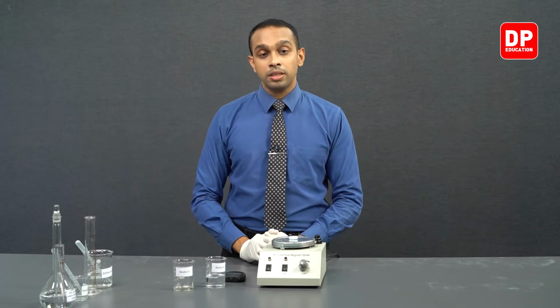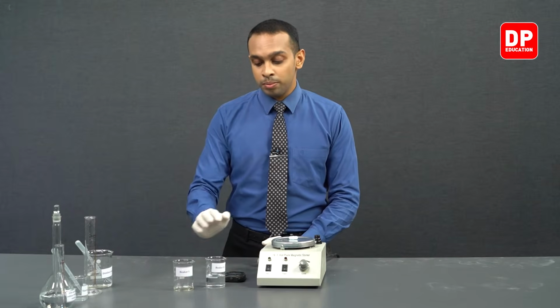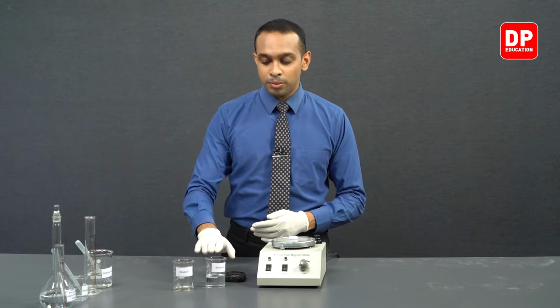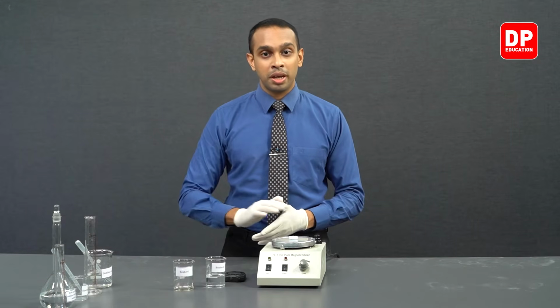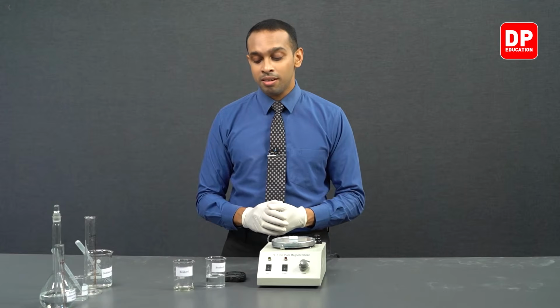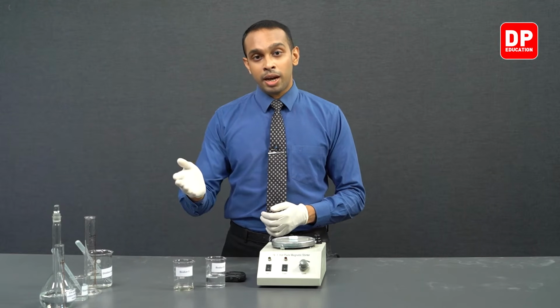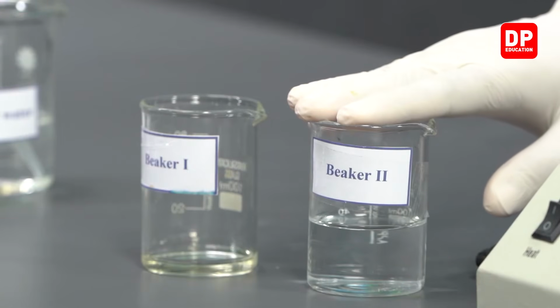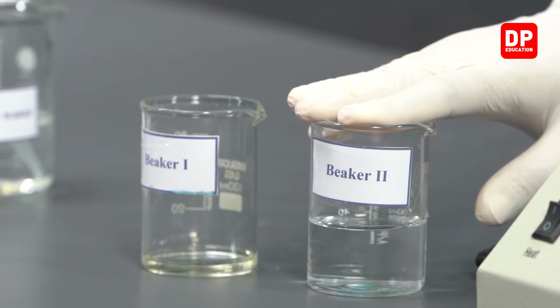And then all that is left for us to do is to mix these two together. Let's keep in mind, when it comes to these two reagents, their main reaction is between I minus and Fe3 plus ions, and the produced I2 will react with a specific amount of thiosulfate ions that are in the medium.